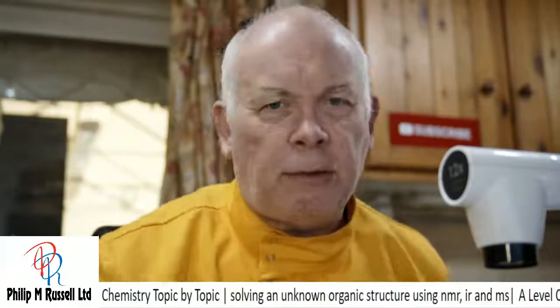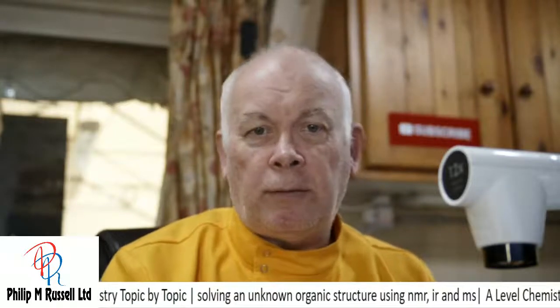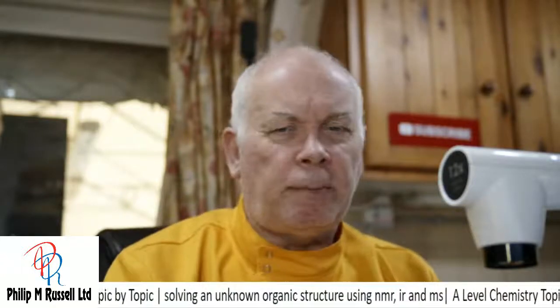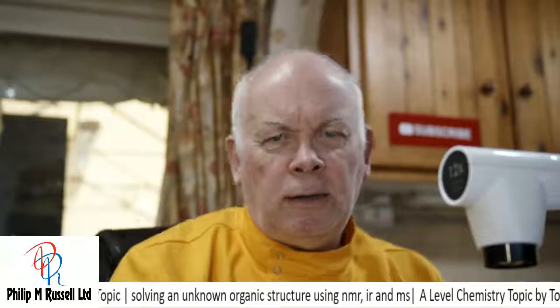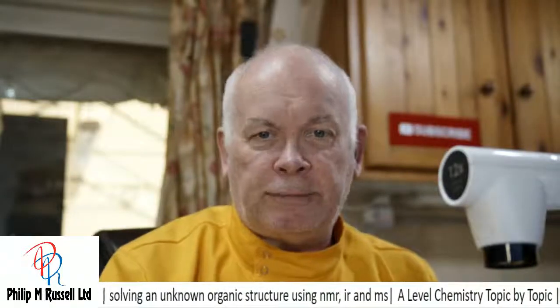So there we are, looking at IR, looking at NMR, both the carbon and the proton NMRs, to try and work out what we've got, and that with the mass spec helps considerably. We don't use UV so much. That is more for fingerprinting different chemicals.